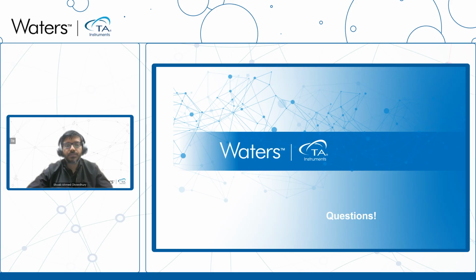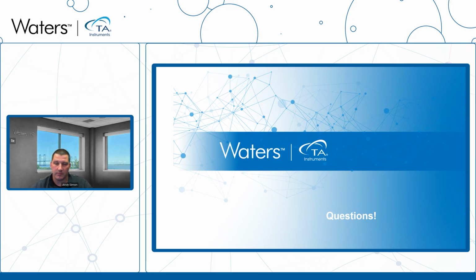Yes, thank you, Shoaib. Definitely keep the questions coming in. We have a few more here. So the next one is, how can DMA, tensile testing, and fatigue testing work together to provide kind of an efficient testing plan to characterize the material?